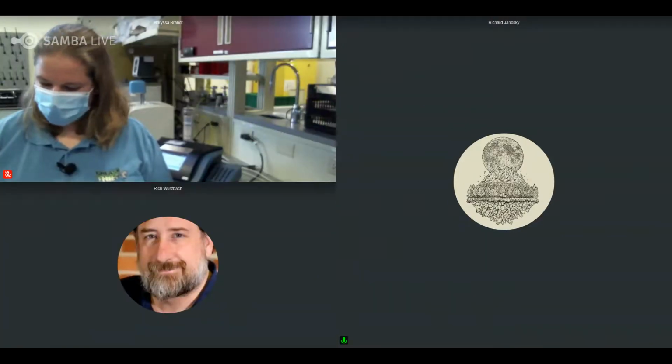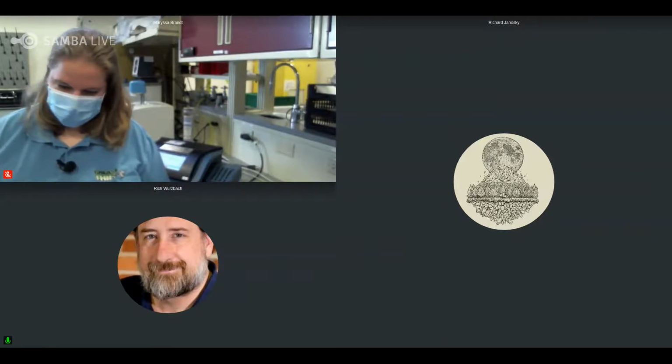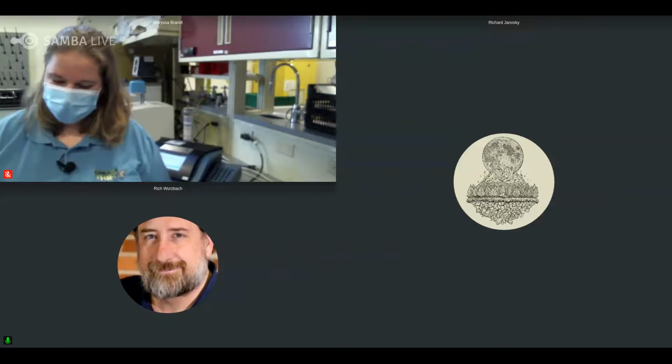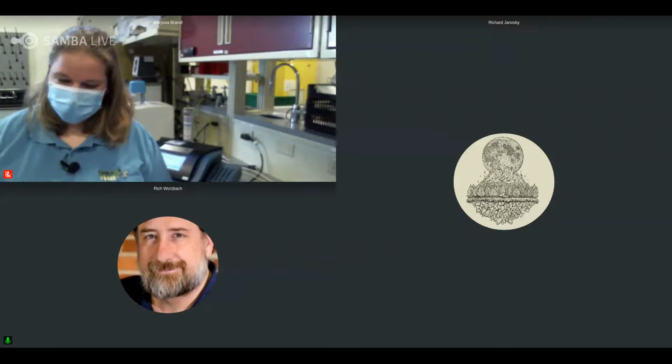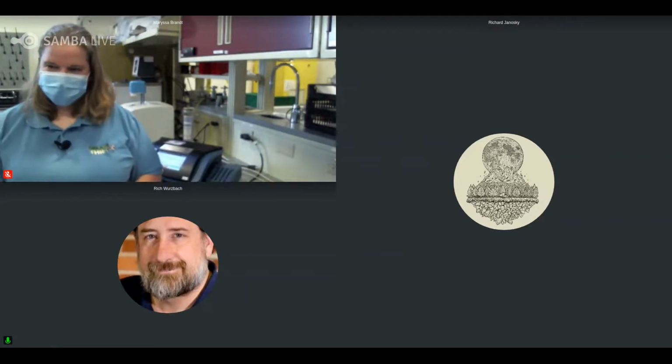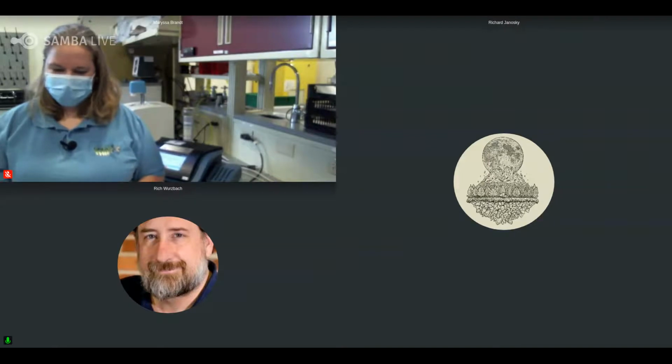So Richard, for the case that we're primarily using this device for, which is greases, it's important to be able to characterize what that initial program should be, what that time of purge should be, and really what the temperature and profile should be in order to optimize for measuring what's in greases. And that, of course, would be validated by introducing greases with known moisture levels to know that this is accurately representing that.